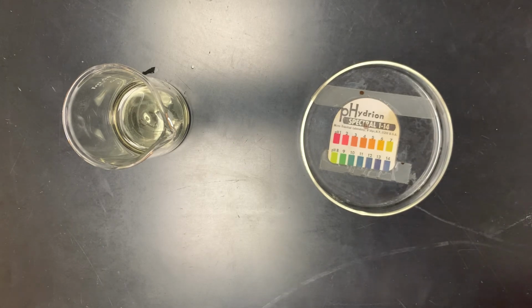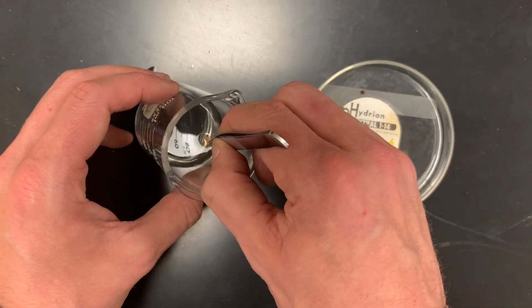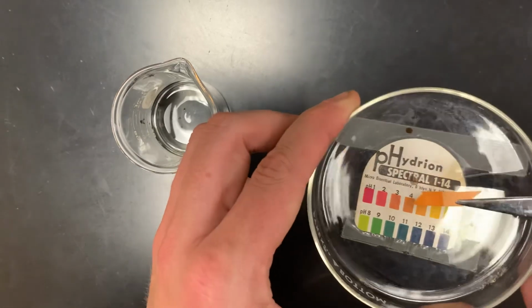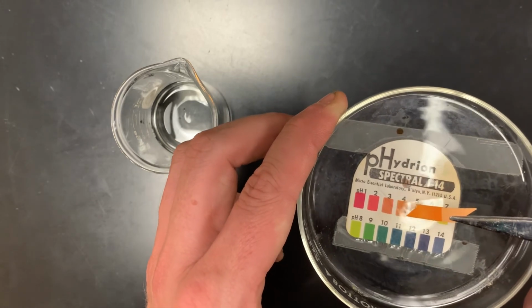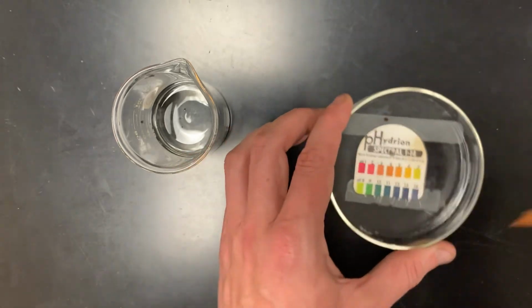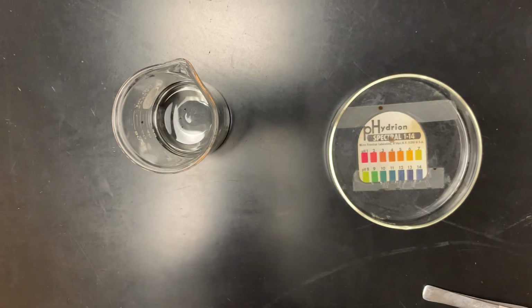And last, but not least, I suppose, we've got ammonium chloride. And this is looking maybe somewhere in that 4 to 5-ish region. Kind of tough to tell. Somewhere between 4 and 5. Okay. All right, and that'll be the data for part 3 of the acid-base salt pH lab. Thanks, guys.